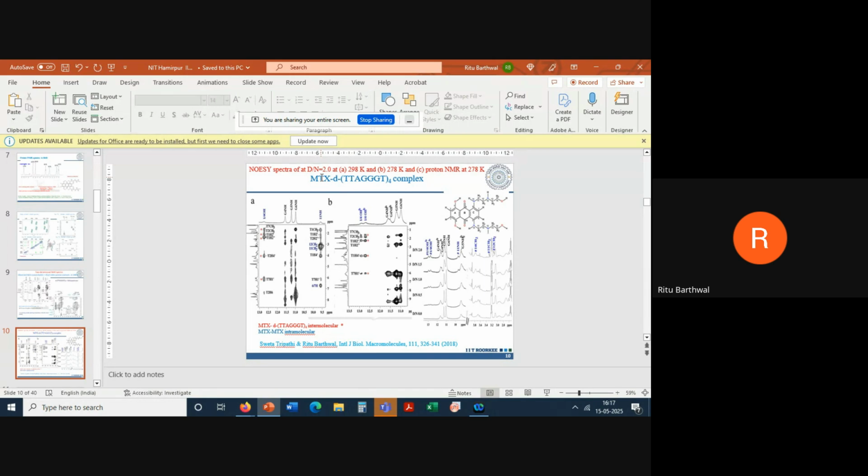Now we have to get the structure. How to get the structure? To get the structure, supposing this is my ligand, I have to know where this H is, at what distance is this H from my sugar, from my base guanine 3, from guanine 4, from guanine 2. So from each atom I have to calculate distance. Now this is manually very laborious, but there are ways of doing it. As I told you, algorithms and all have been developed. And so we will know all these distances from here. These distances, we put them in a table form.